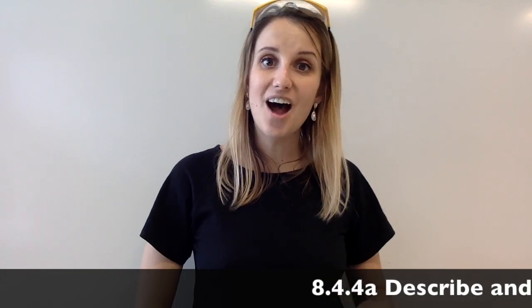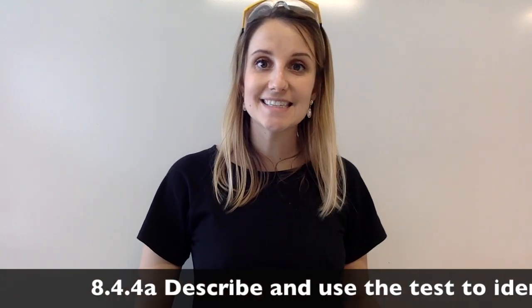What we're going to be answering today is how can I prove that a gas is ammonia?